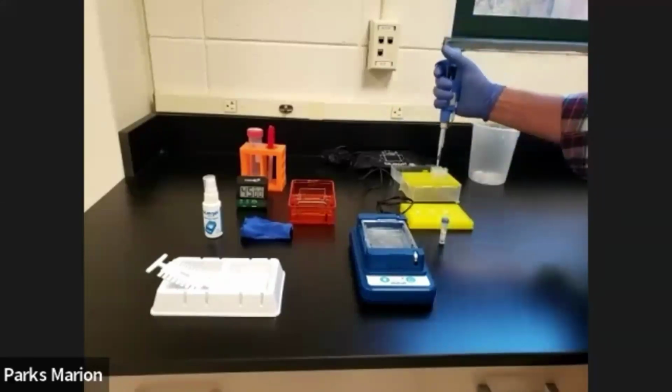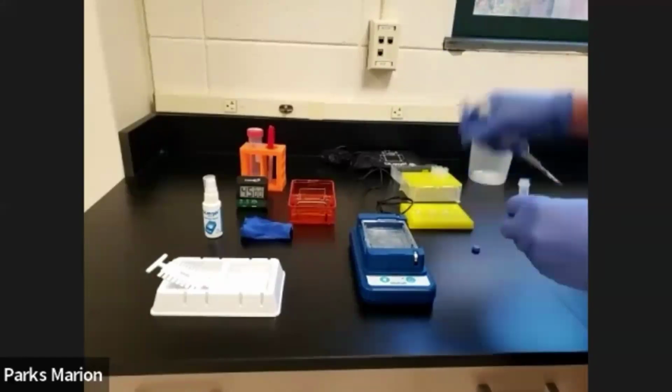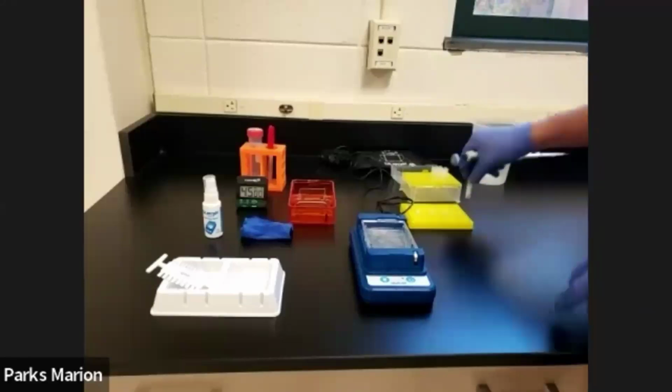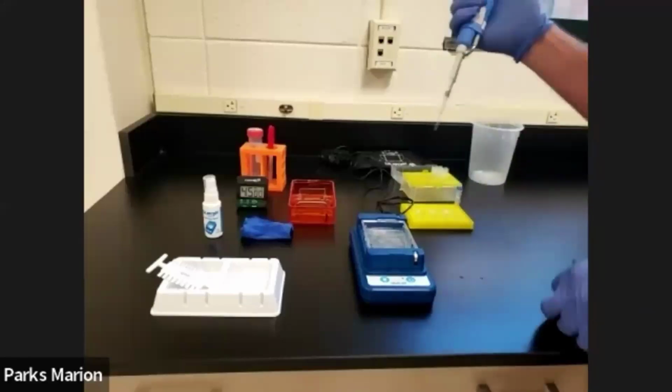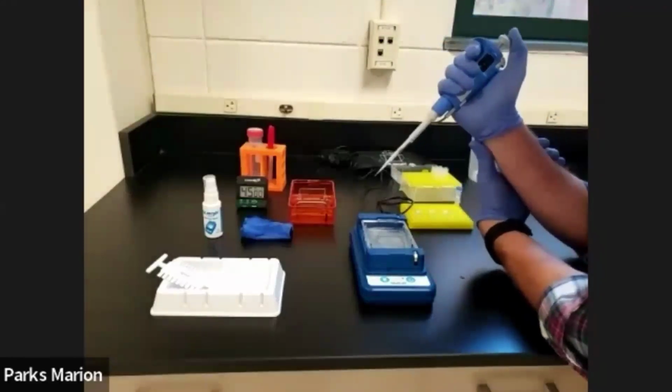We get a fresh pipette tip, open up our ladder here, obtain 12 microliters, close it back up, don't want to spill it. And dispense those 12 microliters into the well.